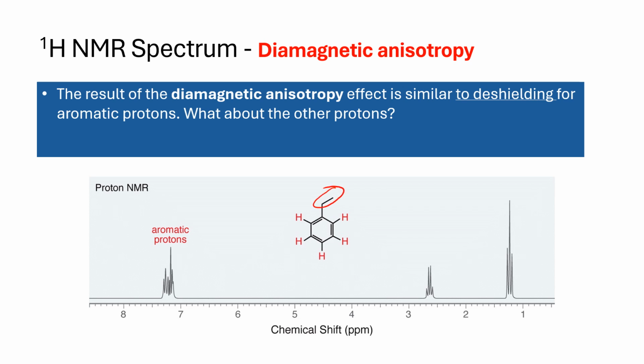Now this is the spectrum of ethylbenzene. And as you see here, these are 5 aromatic protons. Notice this region is complex. And you have an ethyl group. That's your ethyl pattern. And quickly, remember that here you have CH3, CH2. The CH3 has 2 neighbors, so these are looking at n equal to 2 neighbors.